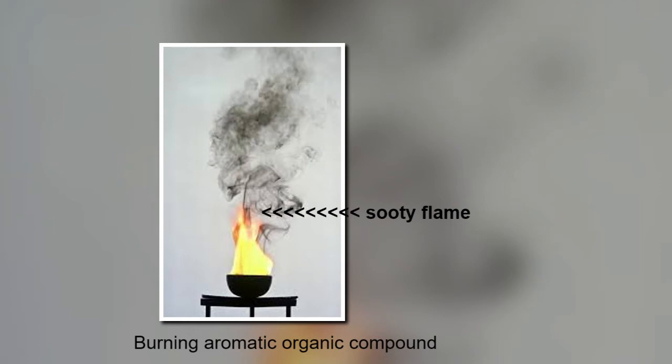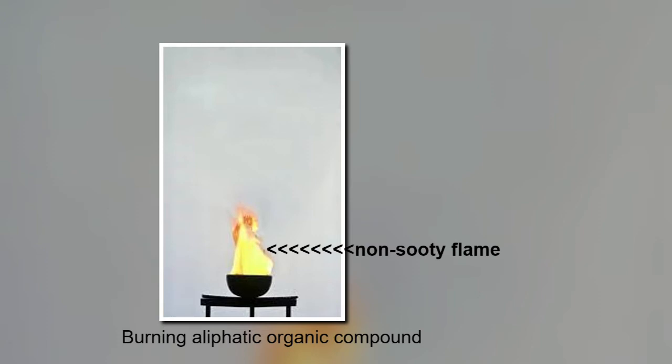For organic samples, aromatic compounds burn with a sooty flame. This might also be observed with high molecular weight hydrocarbons. Aliphatic compounds burn with a non-sooty flame.